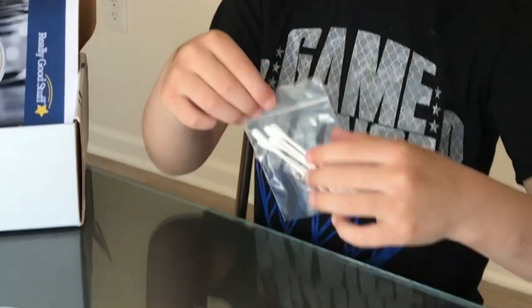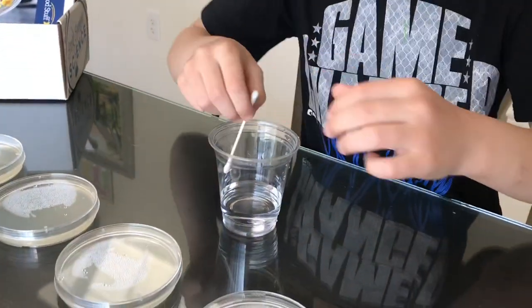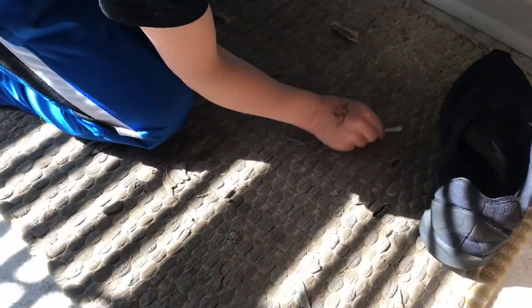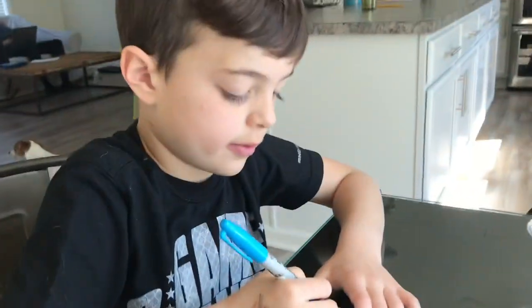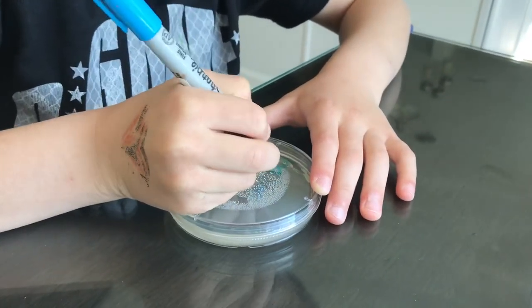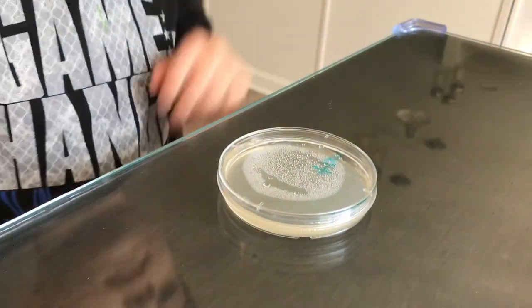The swab! Let's dip it in the water. You're gonna do the doormat? Yeah. Let's do it under the shower. Now we're gonna label it. We're gonna place it aside and move on to the next one.